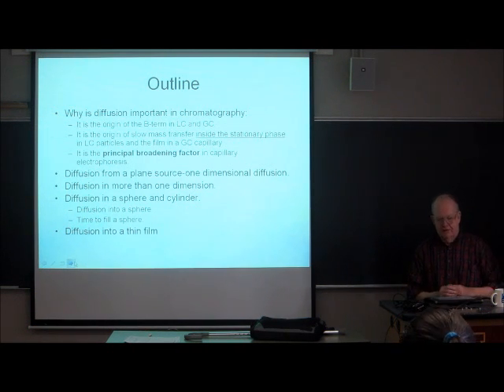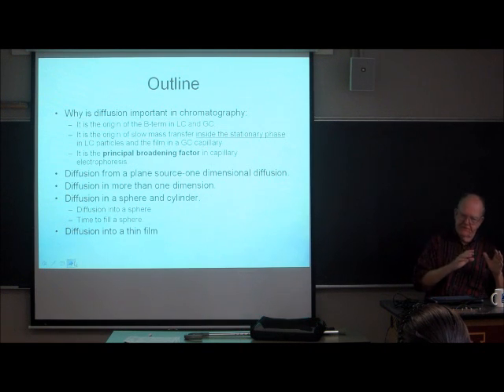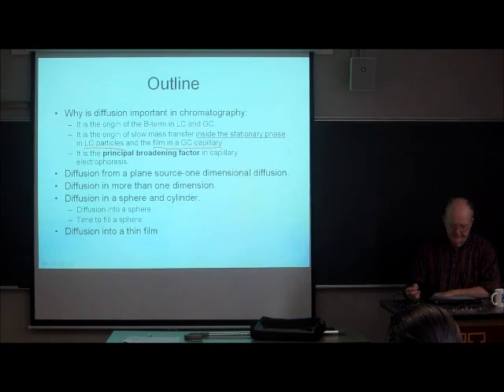Diffusion is the origin of the B term in the Van Deemter equation in both liquid chromatography and gas chromatography. It is also the origin of slow mass transfer inside the stationary phase. Outside the stationary phase, other things happen, but inside the stationary phase, the only way we have to transport material is by diffusion. And this holds for both the inside of LC particles, and it holds for a GC capillary.